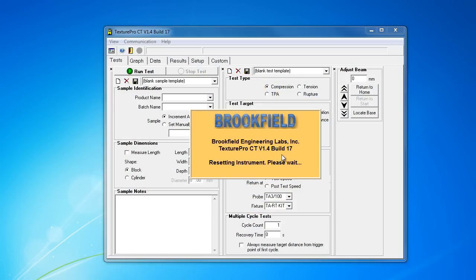The first thing you notice when you load up the program is the max the program runs at is an 800 by 600 window size. On modern monitors, it's almost comical.